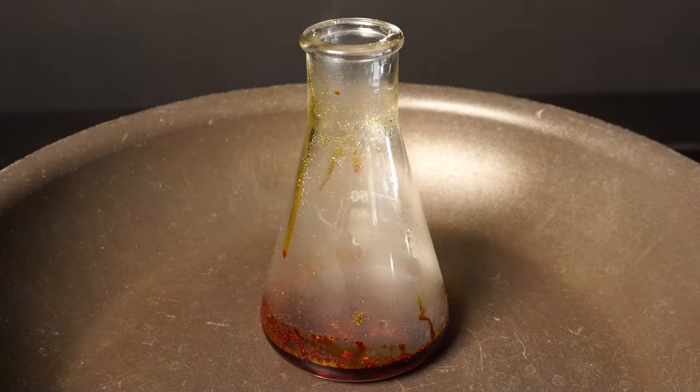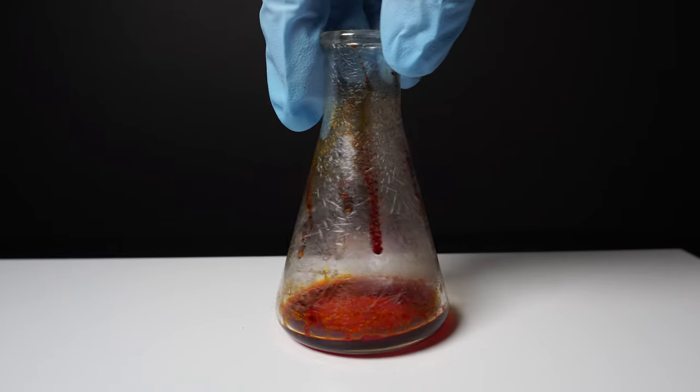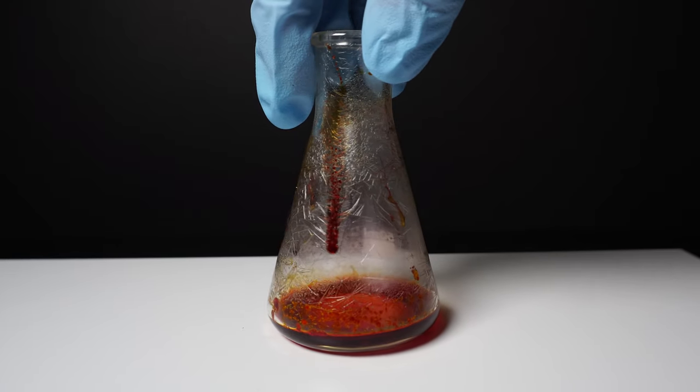As the reaction slows down, we might have to stir it around a little bit to get everything to react. Once it is cooled, we can see the fluorescein crystals on the side of the flask and a red thick oil at the bottom.